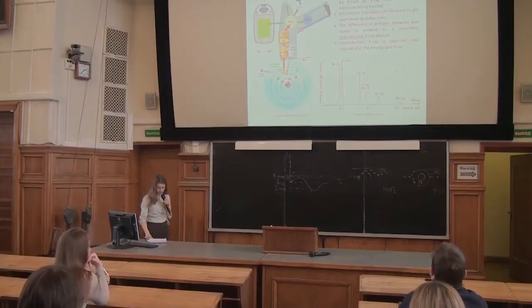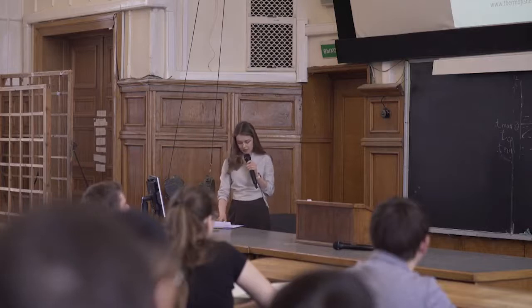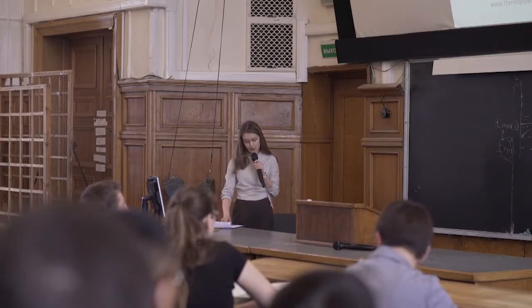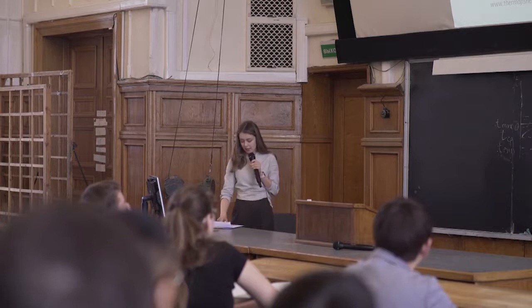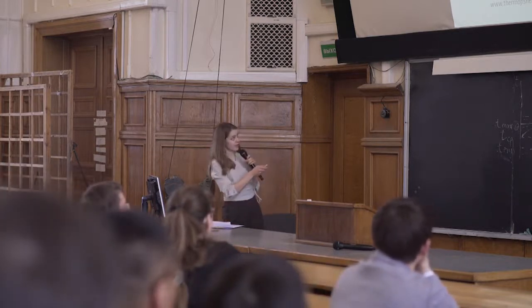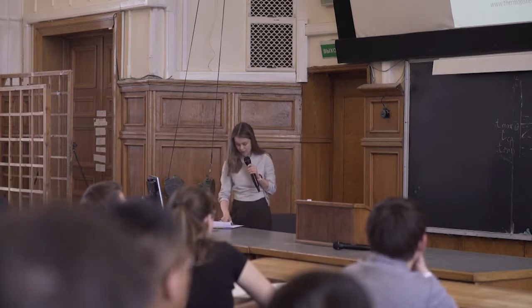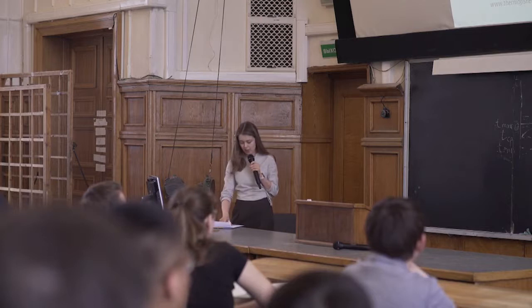Each electron transition in each specific element has its individual energy value, so by the energy of the photon, we can decide on the atom of which element emitted that photon. That is why secondary radiation is also called characteristic radiation. And by the intensity of that secondary radiation, we can say how many atoms of that kind there are in the matter being analyzed.